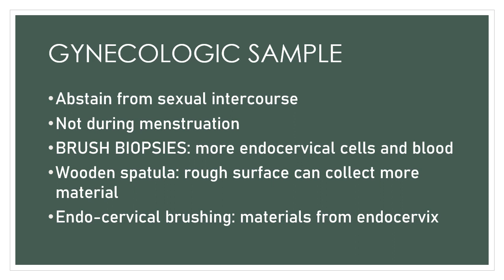And then, of course, your endocervical brushing. Your endocervical brushing is used strictly for taking materials from your endocervix.